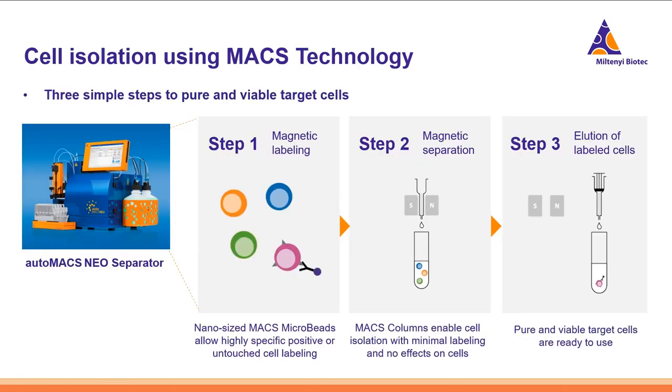Here we are talking about the cell enrichment process, which is very important for many downstream assays. This is done through the MACS technology, so magnetic activated cell separation. I won't go into details for this, but I will let you know that this cell enrichment process does not induce stress on our cells, and it does not impact our viability.